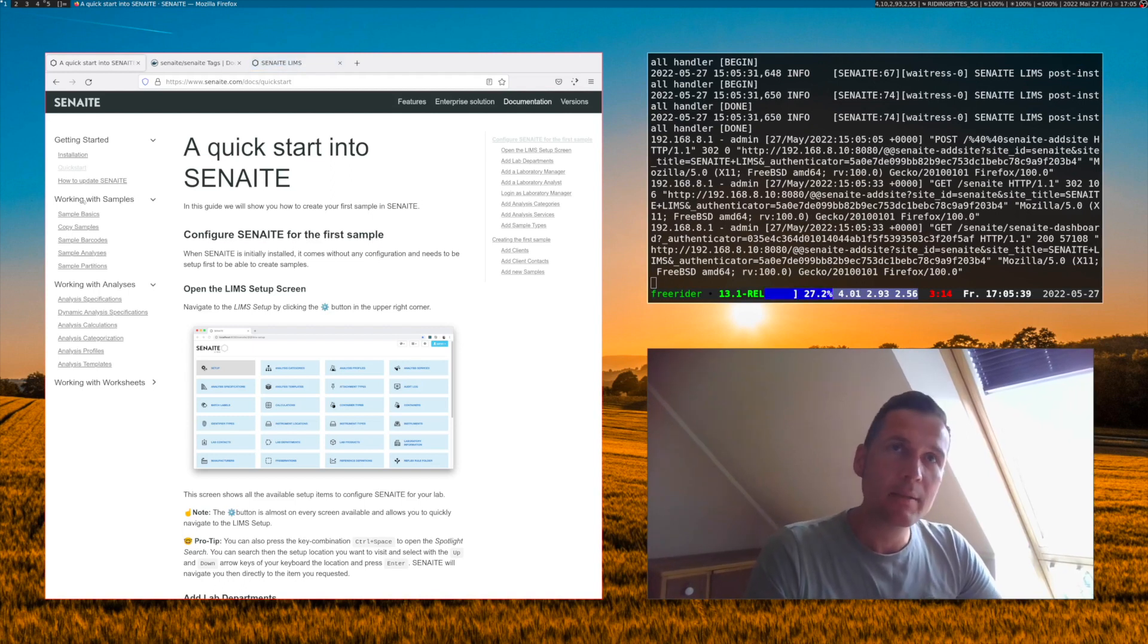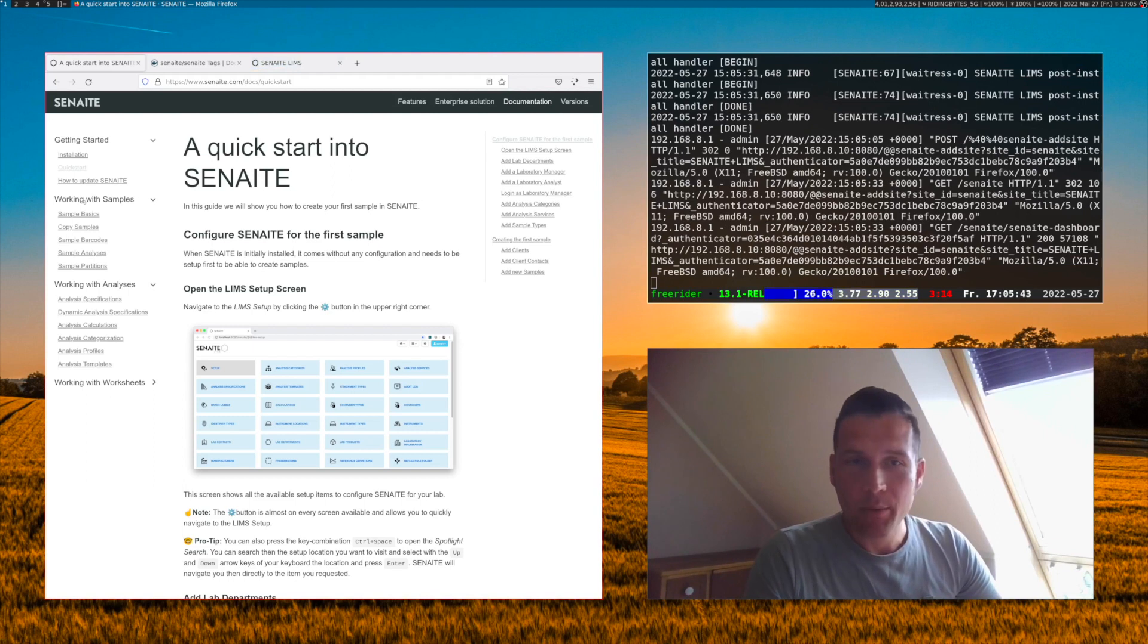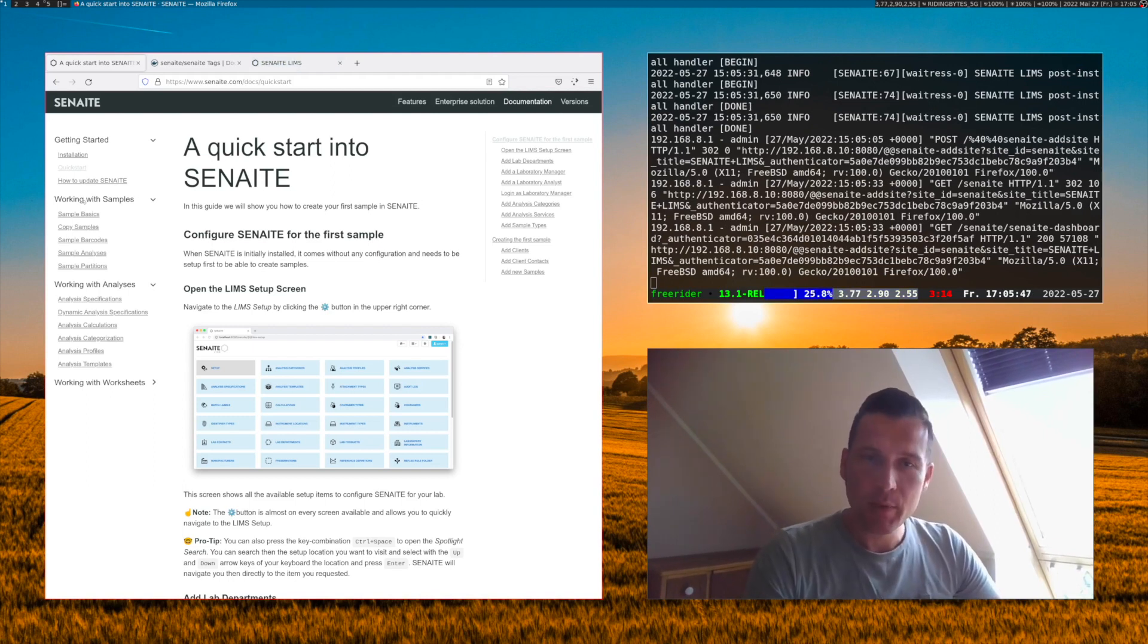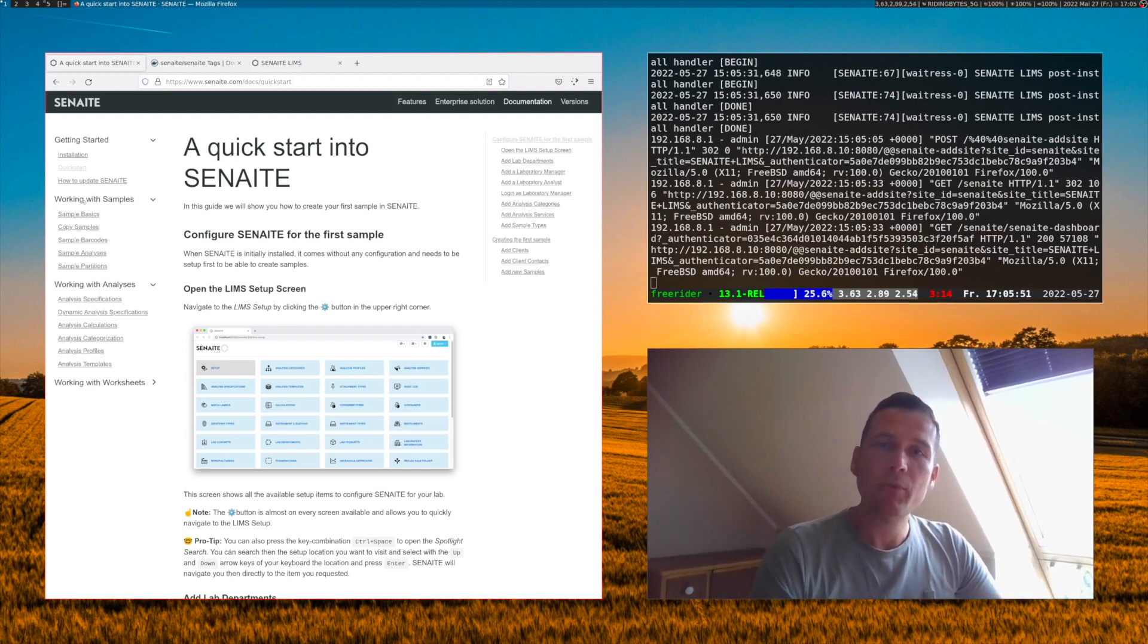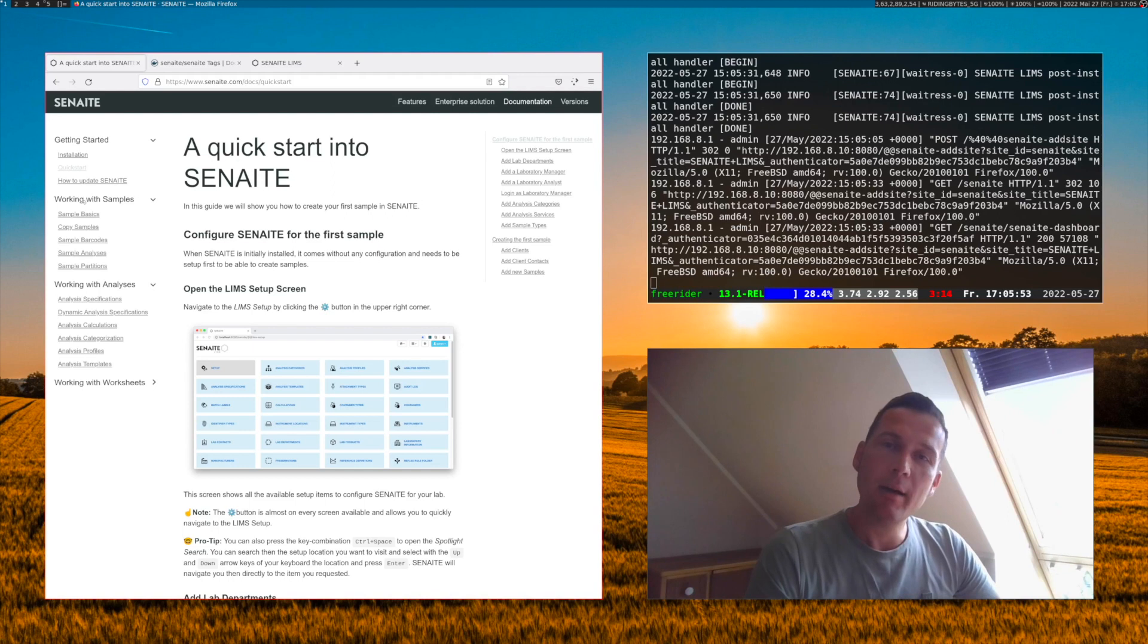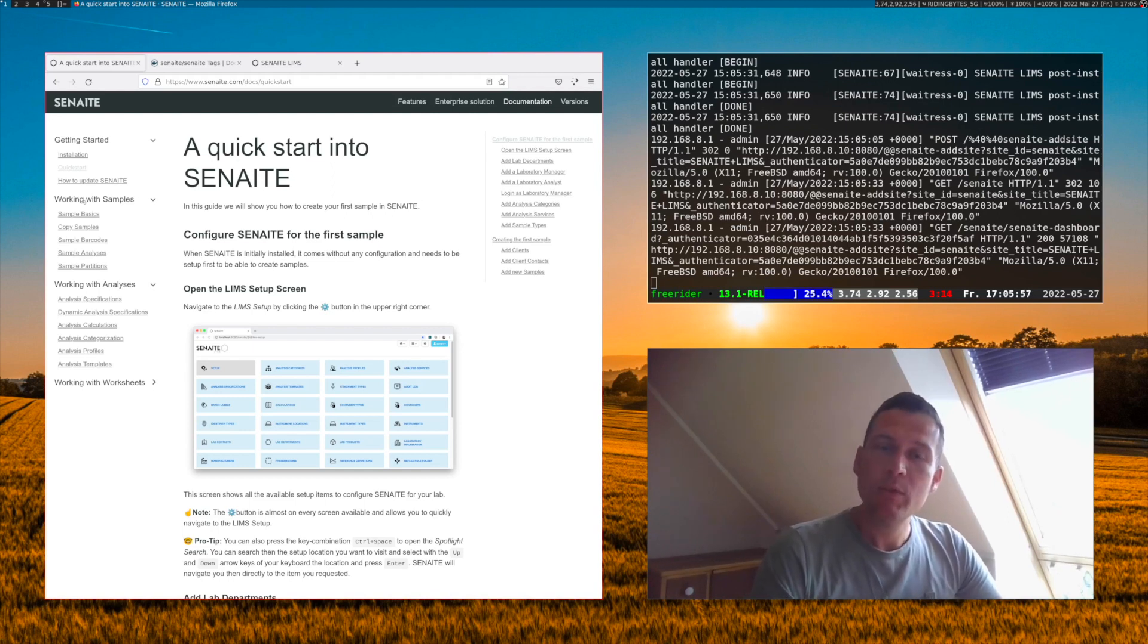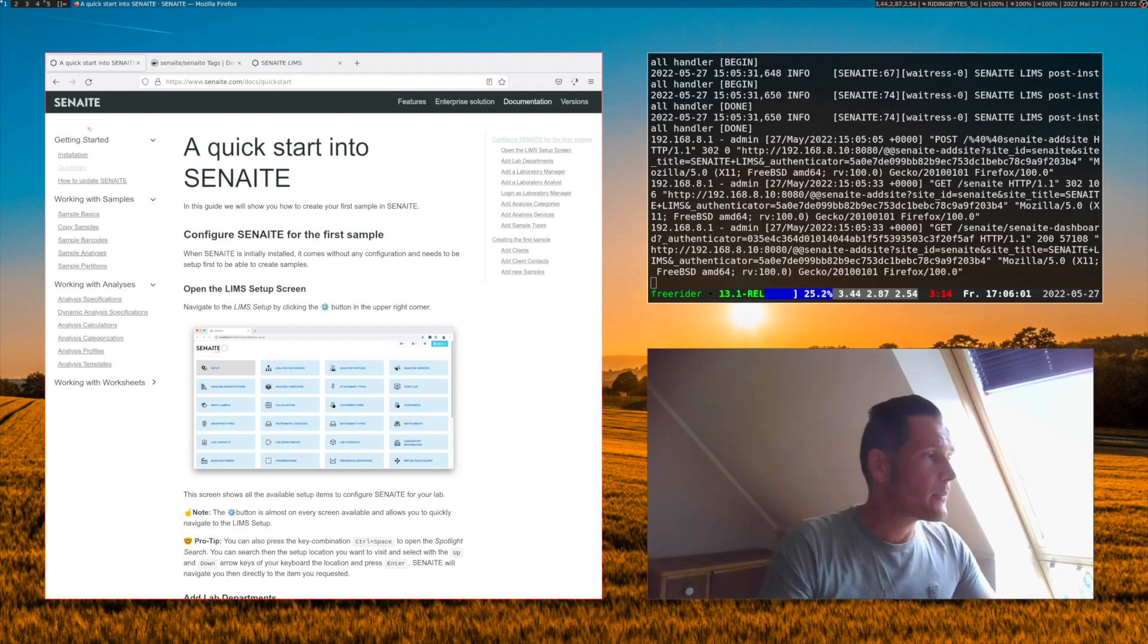how to work with worksheets, how to work with calculations and so on. This will give you a nice little overview about the functionalities that are inside Senn8 and help you decide if Senn8 is the right choice to go ahead for your laboratory.